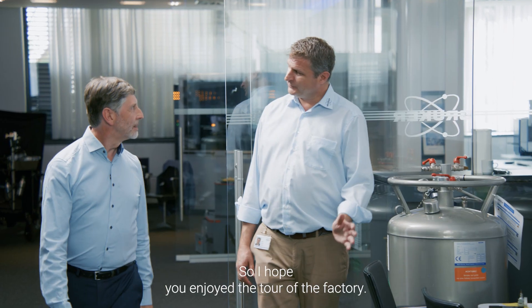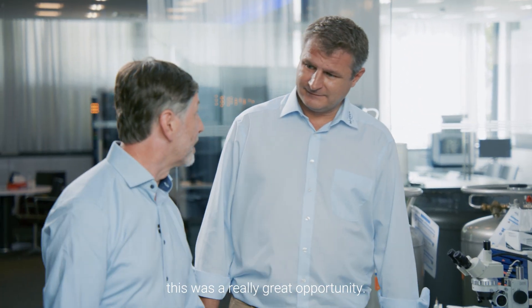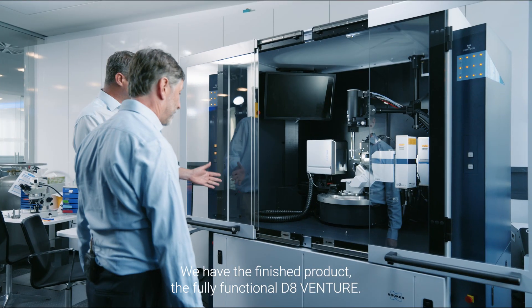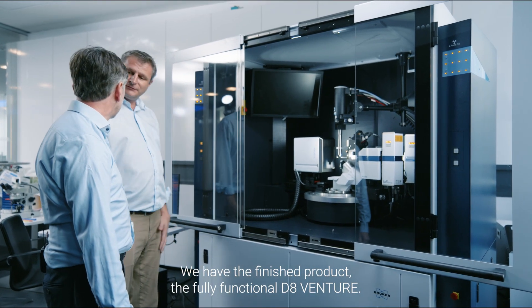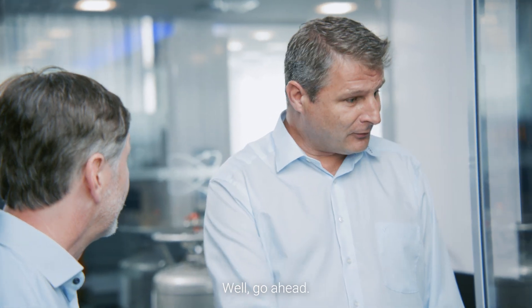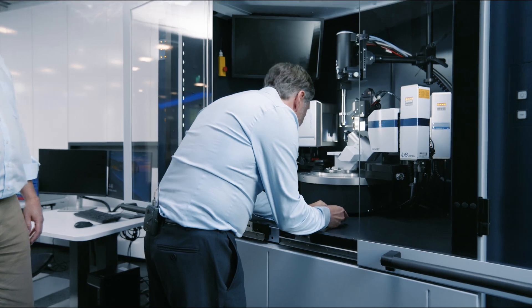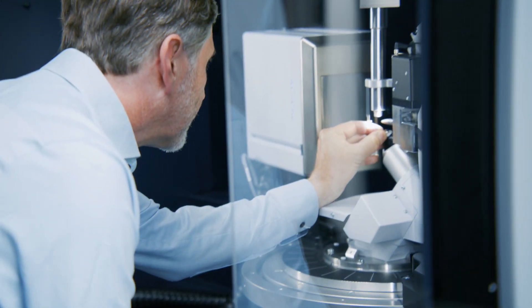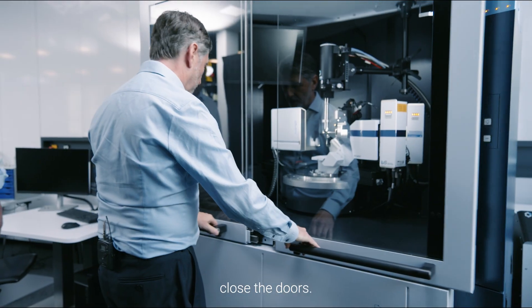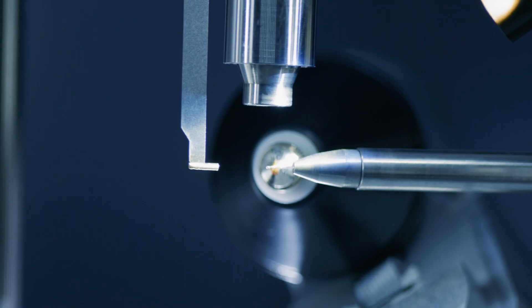I hope you enjoyed the tour of the factory. Well, thank you very much — this was a really great opportunity. So we're back in the application lab now with the finished product, the fully functional D8 Venture. Would you like to make a measurement? Yes, of course. Well, go ahead. The crystal is mounted — close the doors. Fantastic, and off we go.